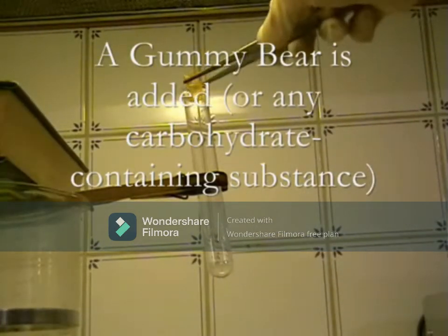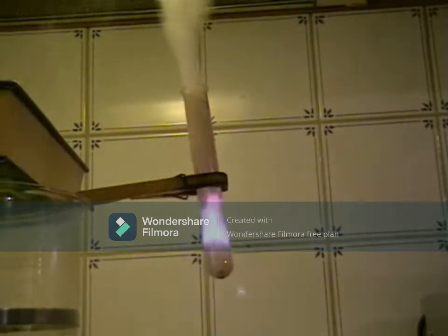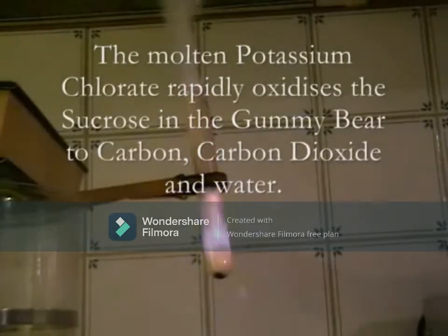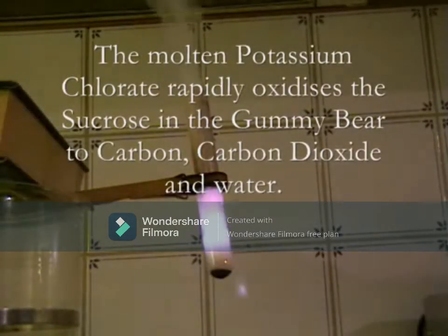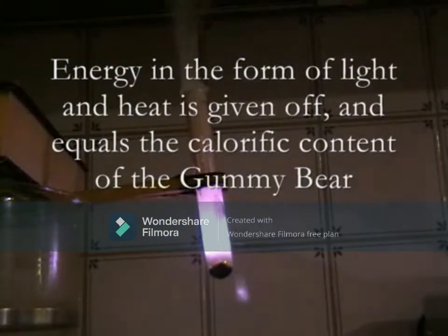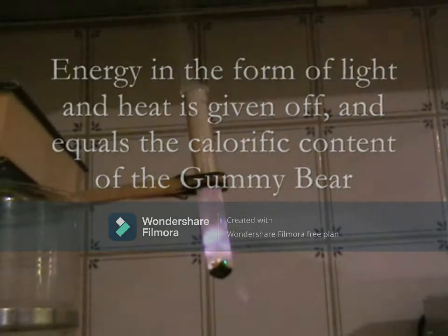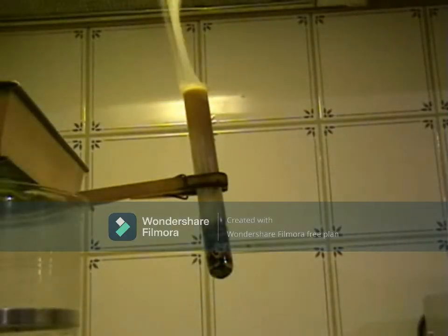Then a gummy bear is added. Whoa. This is an example of a redox reaction or decomposition, where the potassium chlorate will oxidize the sucrose in the gummy bear to produce new products, and a lot of energy is given out in the form of heat and light. The color looks purple or violet because of the presence of potassium, and potassium chlorate is reduced to potassium chloride.